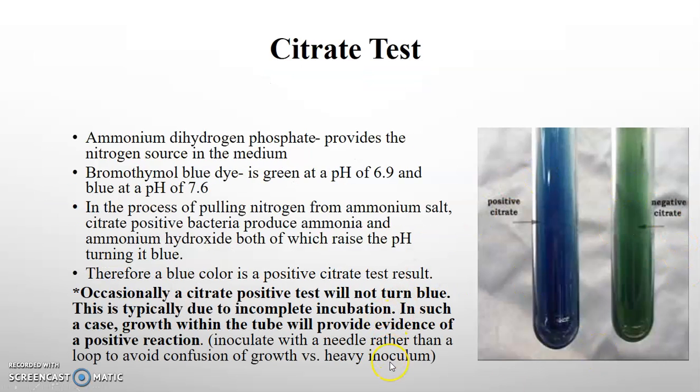So over here we have a citrate test. Typically the citrate test starts out as this kind of green test here. This is just kind of a normal one, and it's in a test tube. And really all you have to do is add a small sample of bacteria into the citrate test. You have videos of this test in D2L, but it is kind of a solid agar that's in a test tube, and it runs on a slant so that you can add the bacteria to the slant.